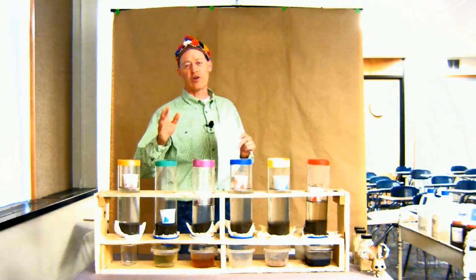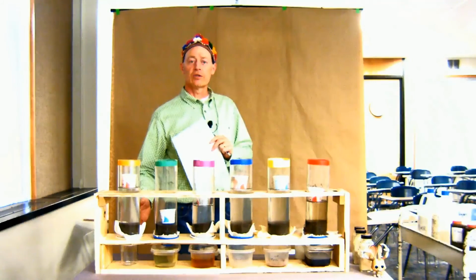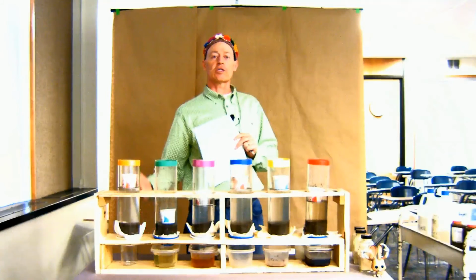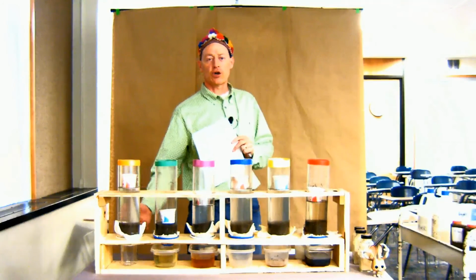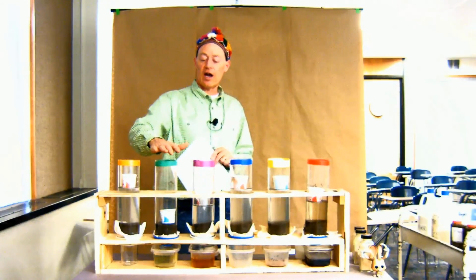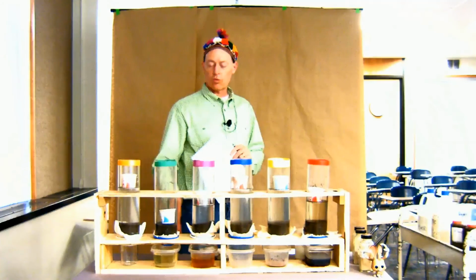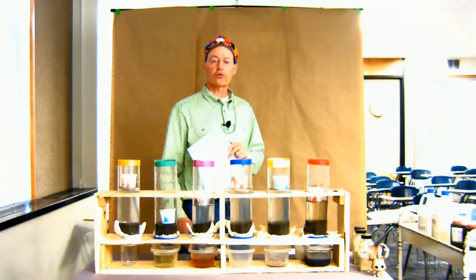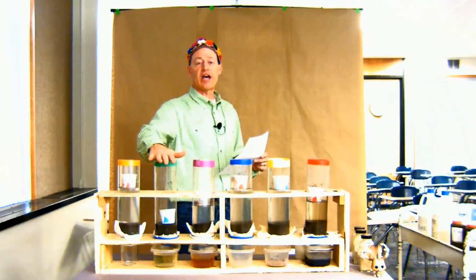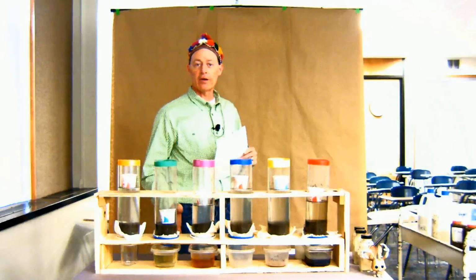Most of you, I think all of you, are going to be moving on. This water will not have moved. Okay, this is basically what happens when the soil is swollen or dispersed internally. Water will not move. However, if you have a high electrical conductivity and add calcium, this is what's going to happen. You're going to end up with water moving through just fine. Now, this is the essence of reclamation or amelioration. This is what we want to happen.